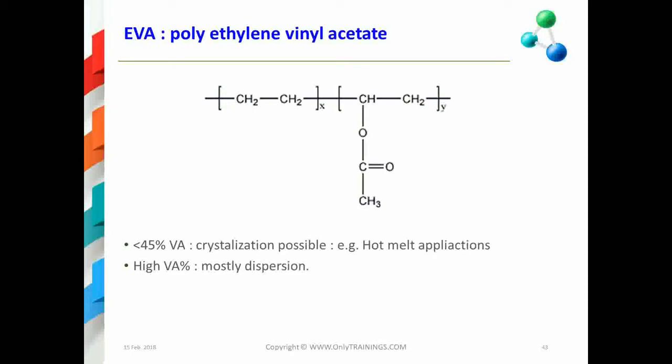Okay, now we have seen the olefins, and now I want to speak a little bit about the polyethylene vinyl acetate structure. What we can see on infrared and what we can see on DMA.